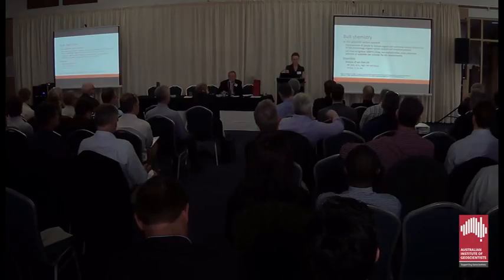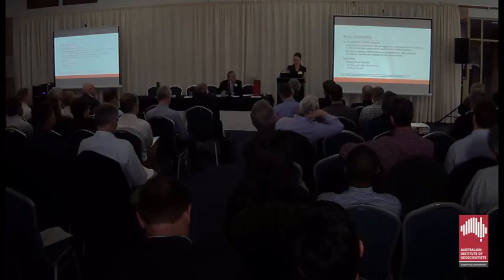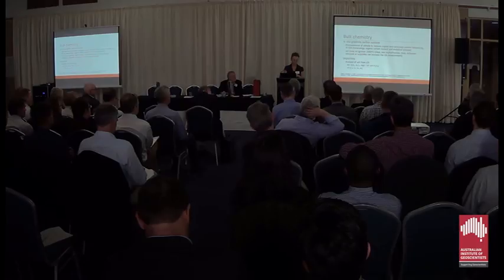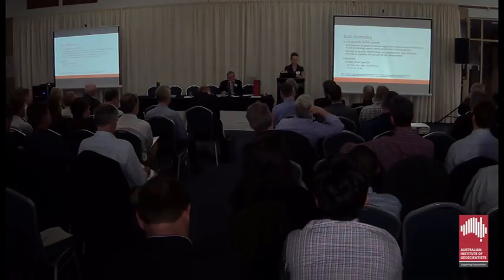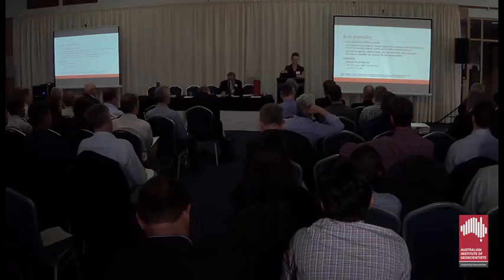The Geological Survey of Canada looked at 7 different methods of analysis and found that all of them gave slightly different results, up to 5% of total graphitic carbon. And one of the reasons is that, depending on mineralogy of the sample, you may need a slightly different procedure for pre-acidic treatment, as well as removal of organic content.